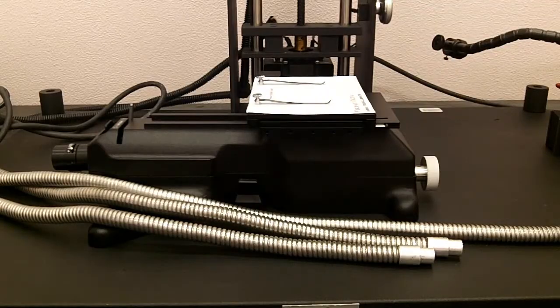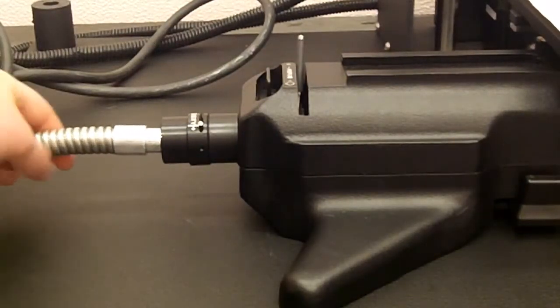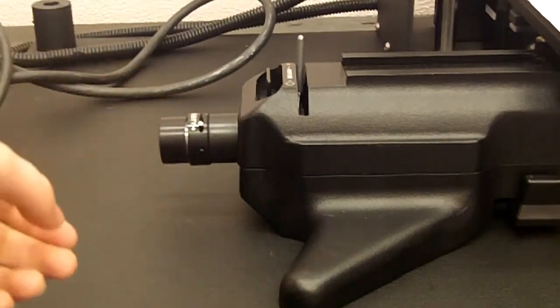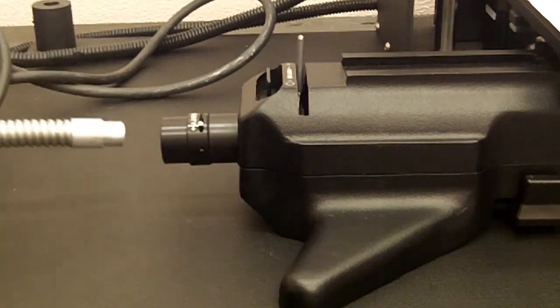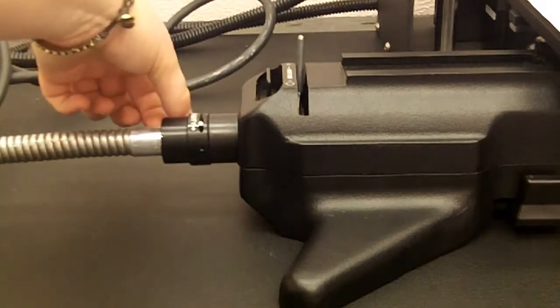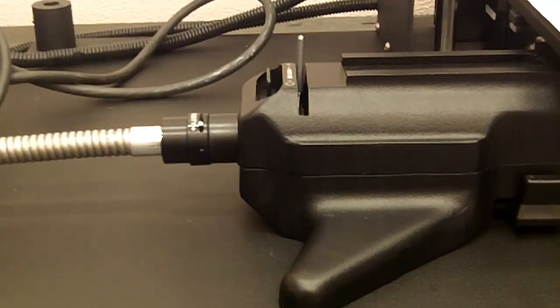So first off, let's go ahead and attach a fiber optic cable into the intensity control of the SolMate, and if you see a little gap of silver, make sure that the intensity control is completely tightened onto the rest of the SolMate. Insert the end of the fiber optic cable into the intensity control and tighten the thumb screw, which is in the back. So now the fiber optic cable is connected to the rest of the SolMate.